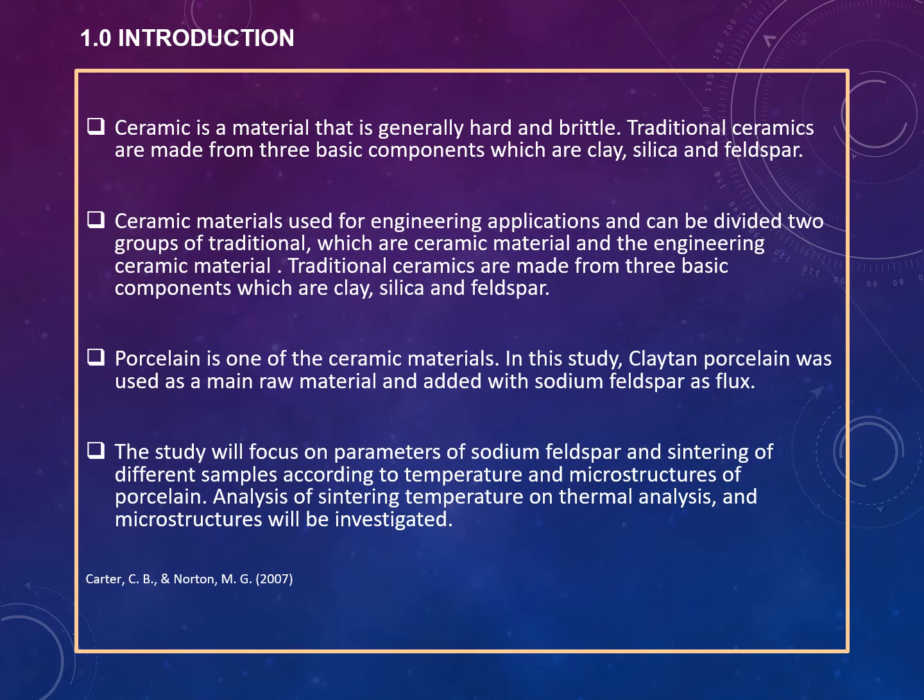In this study, CLAYTAN porcelain was used as the main raw material, with sodium feldspar as flux. The study will focus on parameters of sodium feldspar and sintering of different samples according to temperature and microstructure of porcelain. Analysis of sintering temperature on thermal analysis and microstructure will be investigated.